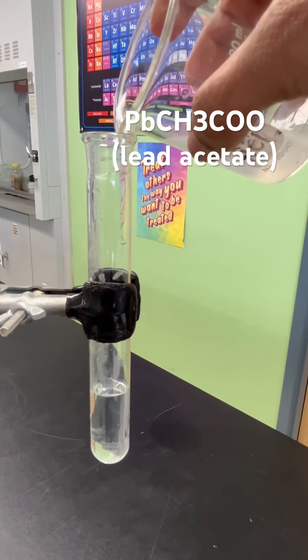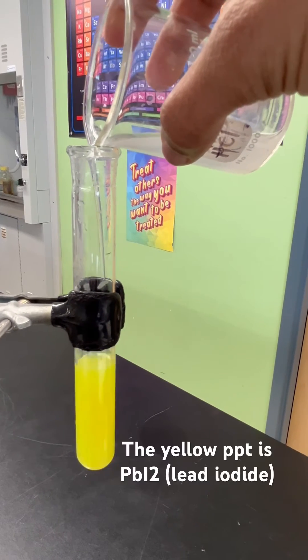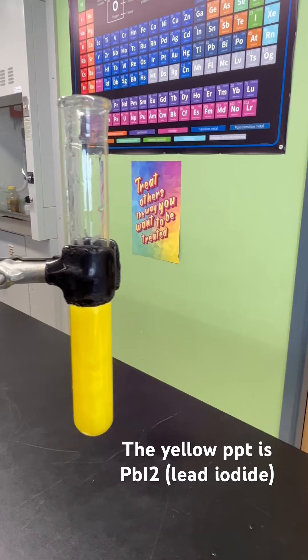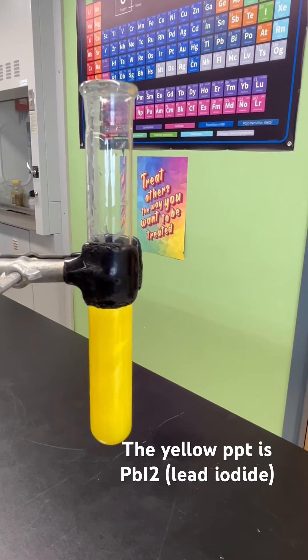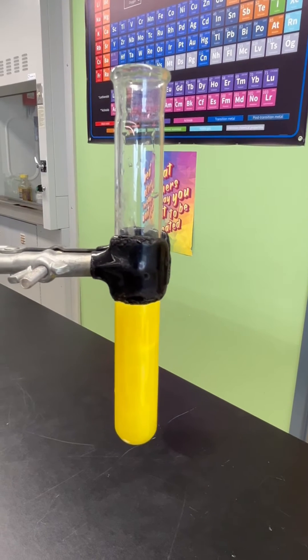And now we're going in with the lead acetate. So let's react the lead acetate and we've got a very nice bright yellow precipitate. It's a solid precipitate that's insoluble in water and that's why it comes out of solution.